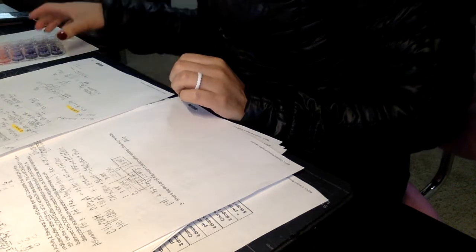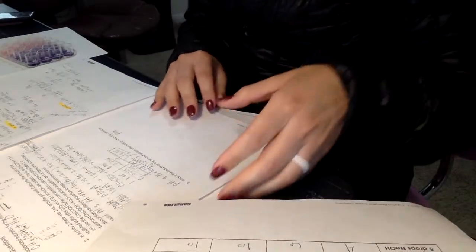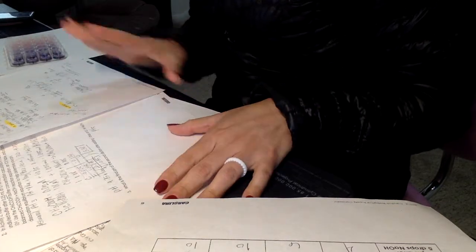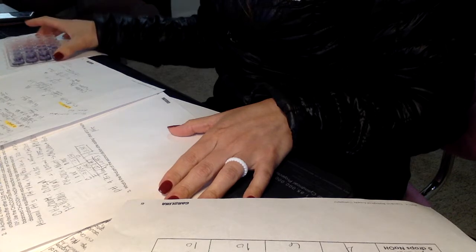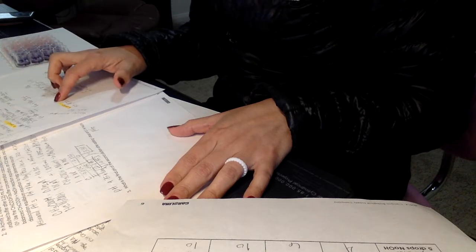Okay, so for this lab where we calculated the pH and tested out the buffering solution, I've recorded the results in the data. First, to get the amount that I was going to use for this lab, I calculated some formulas first.